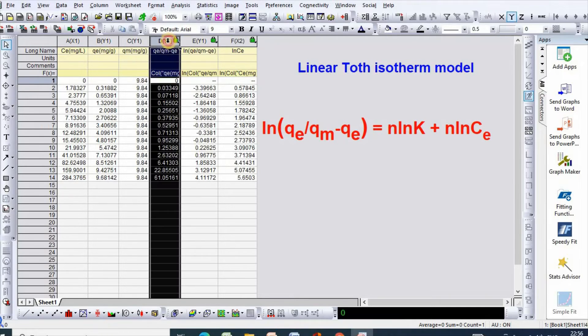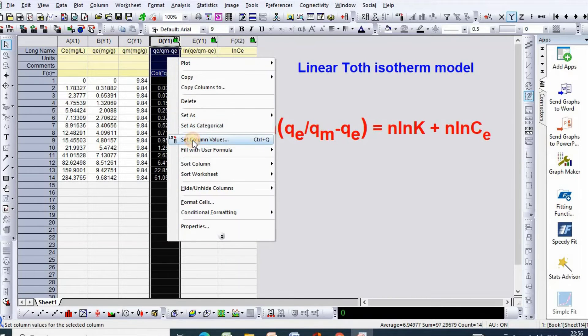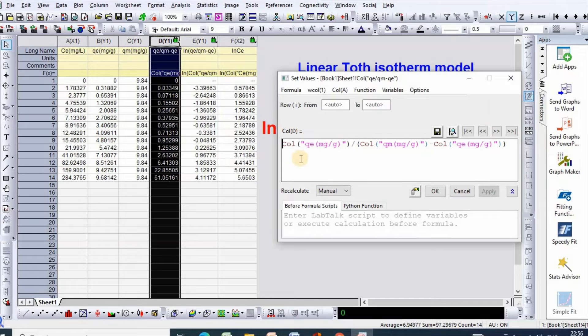How to do that? Just select and click right button and set column value. So, I have set this value.